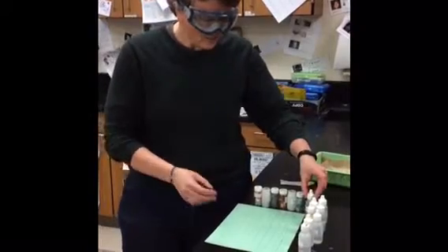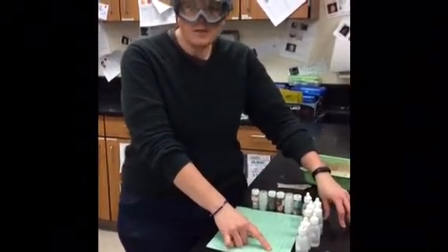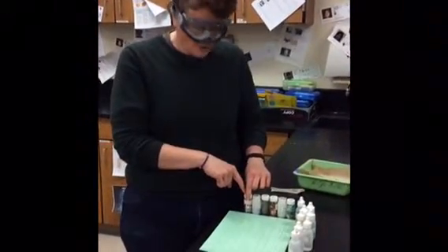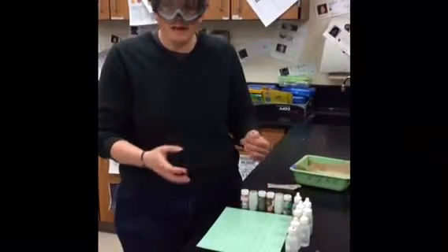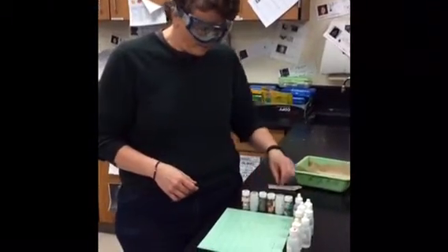My suggestion before you start is to set up your dropper bottles in the order just like they are on the grid. Set up your solid containers, jars, also as they are in the grid. That'll give you the maximum organization and therefore the easiest time with the lab.